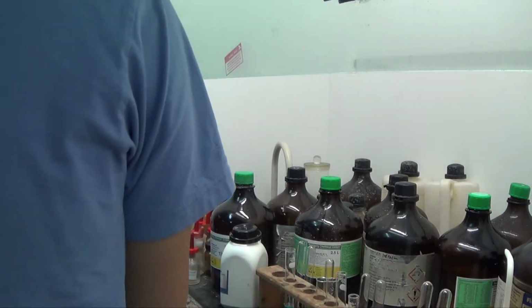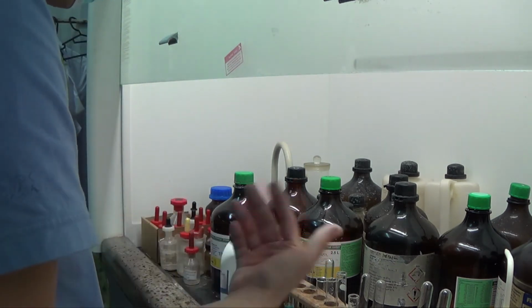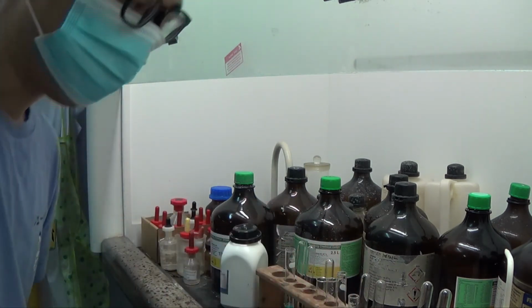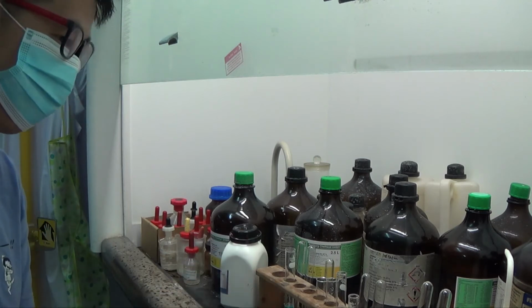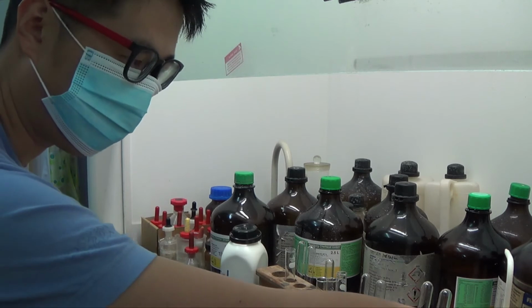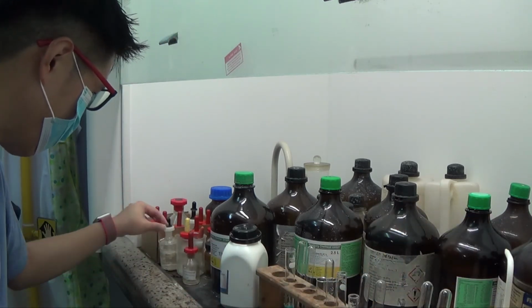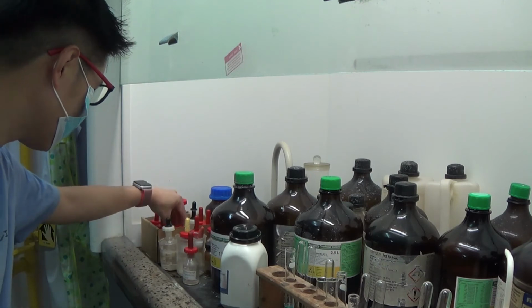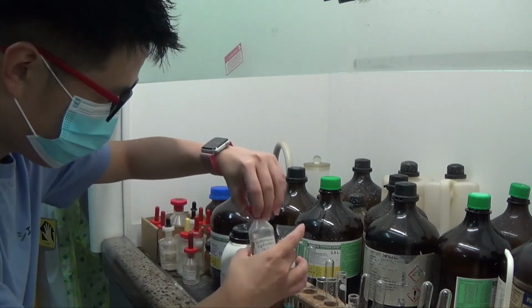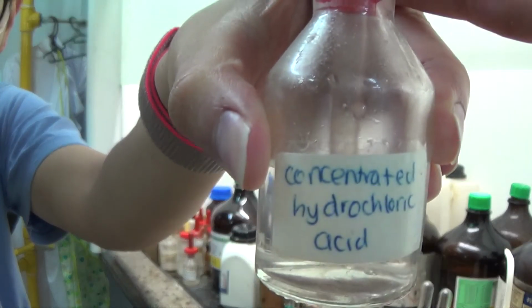Okay, so do I have sodium hydroxide in here? Actually, I've done the sodium hydroxide previously. I'll just append the video from the other experiments into this one. So I'll skip the sodium hydroxide bit and go straight to concentrated hydrochloric acid. So this is concentrated hydrochloric acid.